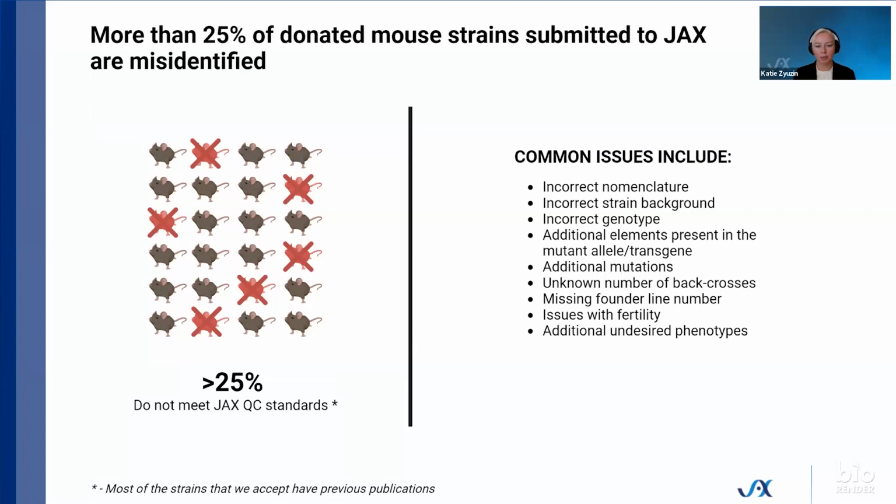Basically, conventional knockout mouse models have one or more genes inactivated in all tissues at all times. So to create such a knockout, the targeted allele is replaced by a neomycin selection cassette that allows for positive selection of embryonic stem cell clones. If retained, such a neocassette can potentially disrupt function of other genes that are nearby. To make sure that the neocassette does not cause such off-target effects, most researchers prefer to delete it altogether. To find out if a neocassette is present or not in your strain, you can run a genotyping assay specifically targeted to check if a neocassette is still present in your strain.